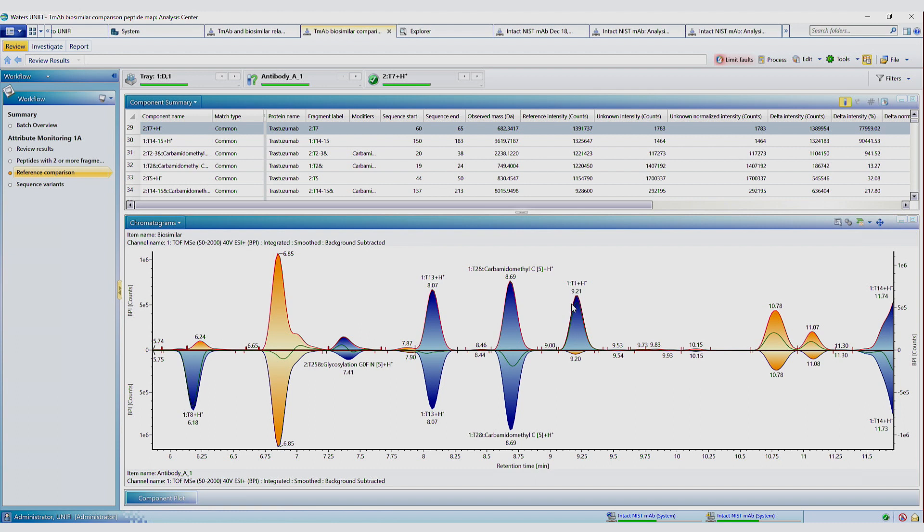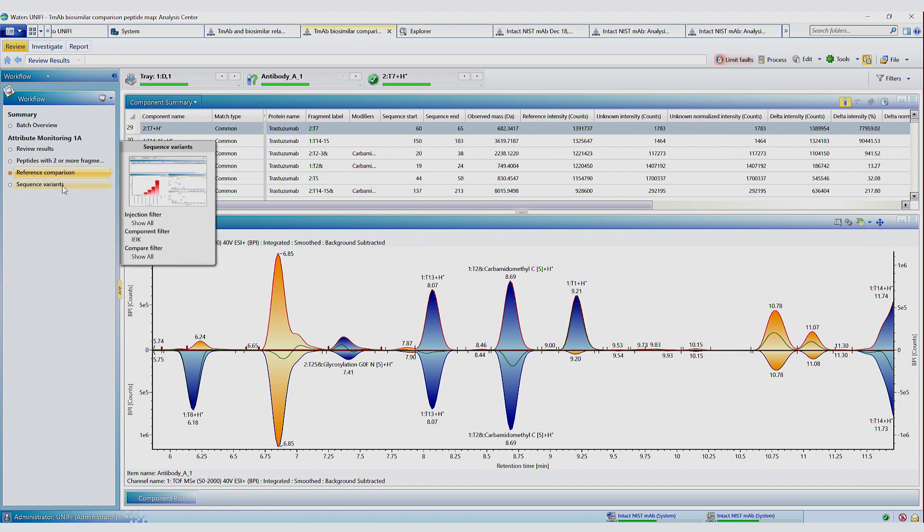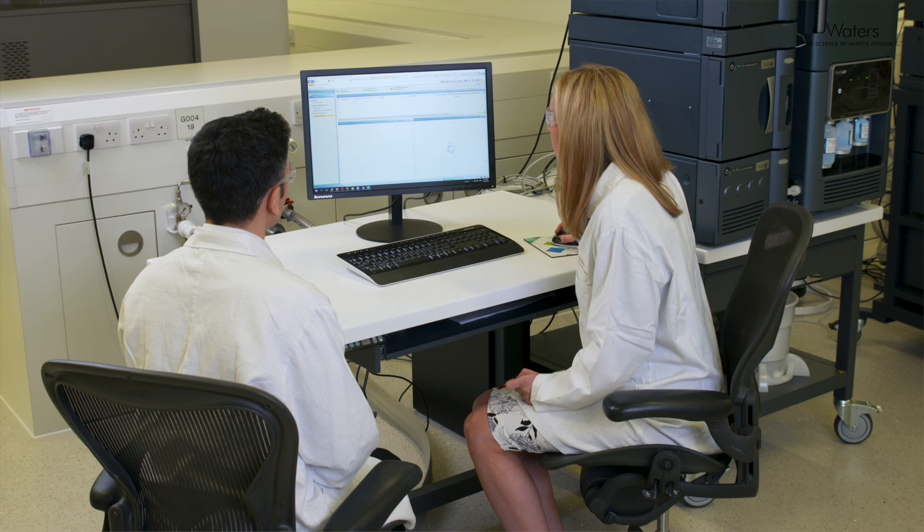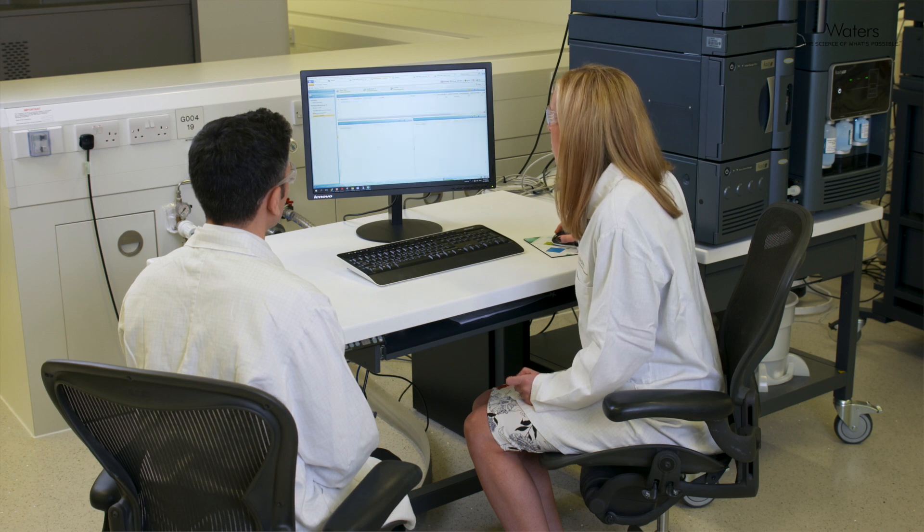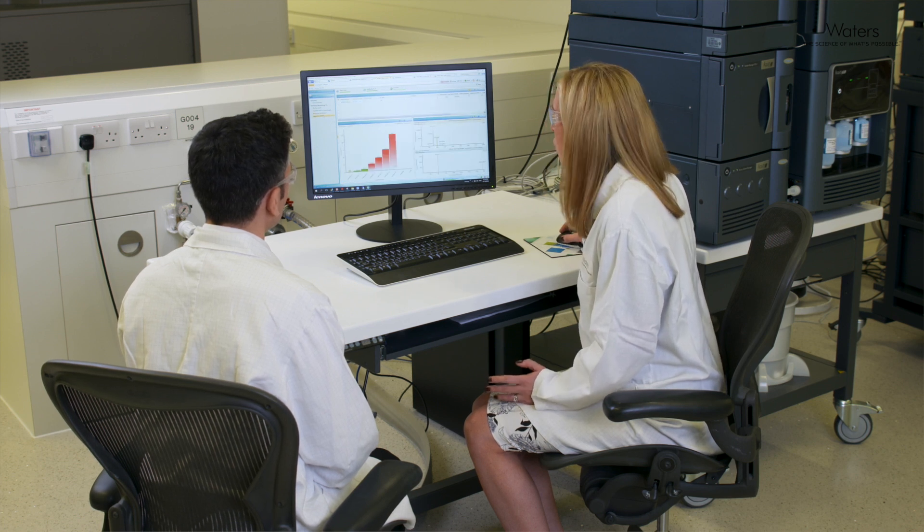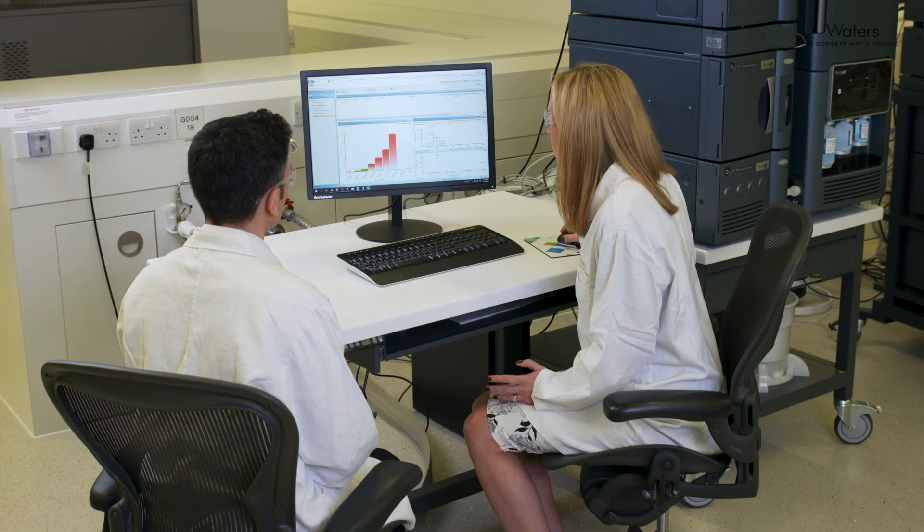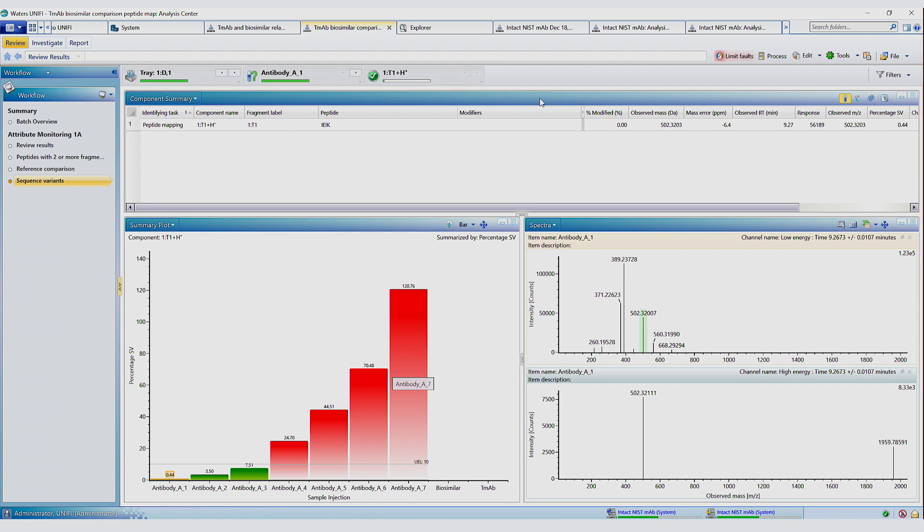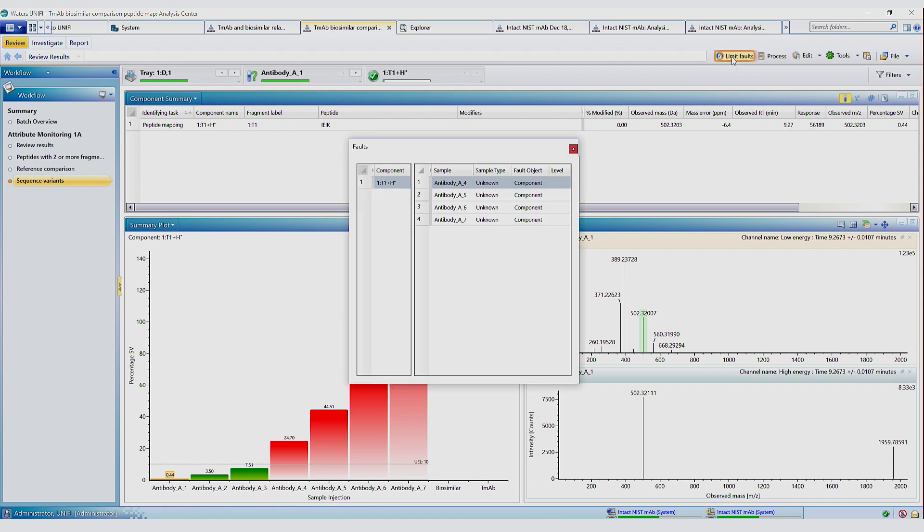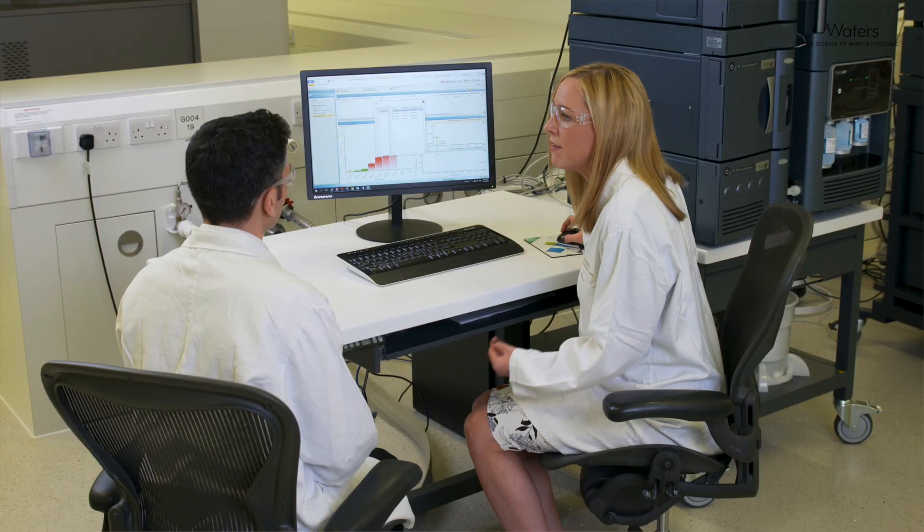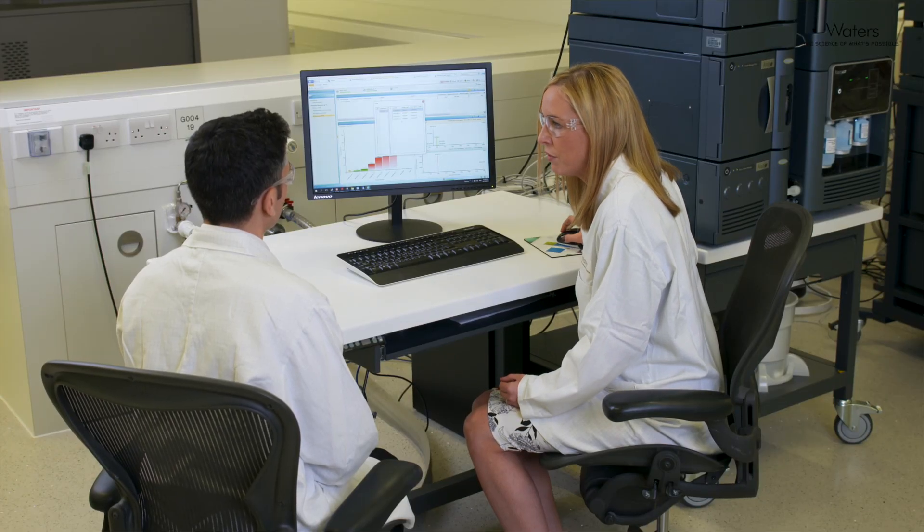If we go on to the next step in the workflow, which is sequence variants, this is how we monitor that particular peptide over a batch of samples. And we've applied some limits here so that if the response of that particular peptide or the percentage amount goes above a certain threshold, it will turn red. And if we click on this limit function here, it will highlight the samples for which that particular parameter has exceeded the threshold.